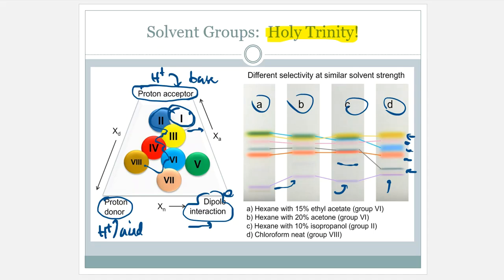Well, again, this is the whole concept of mobile phase selection. All four of these were analyzed with different mobile phases, and you're seeing that the mobile phases play a very drastic role in determining how these things begin to separate and the order in which they separate. Notice that in D, we also get very hazy, fuzzy areas, and quite often we do not like those when they show up. We prefer bands that are very tiny, very slim, no haziness, pretty much just a straight line all the way across, like you would have when you mark it with a pen.